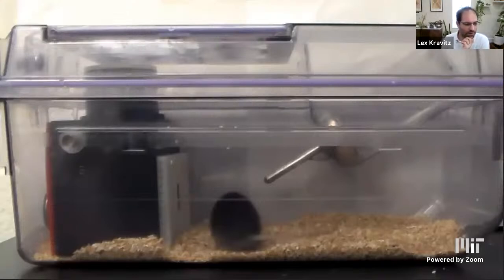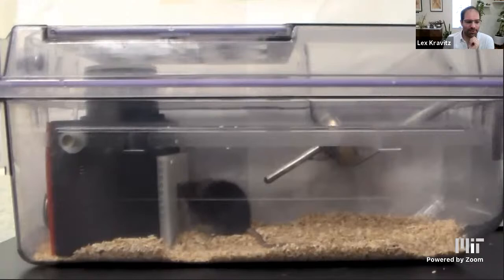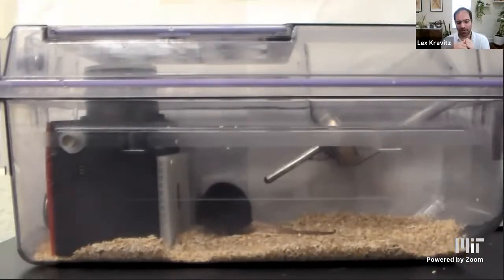Quick video of what this looks like. So this is a mouse. This is the original Fed 1, and the mouse takes a pellet, and the Fed dispenses another one, and over time he can keep taking pellets.